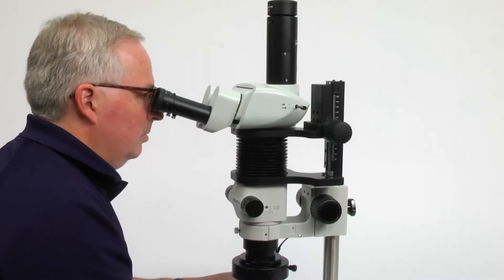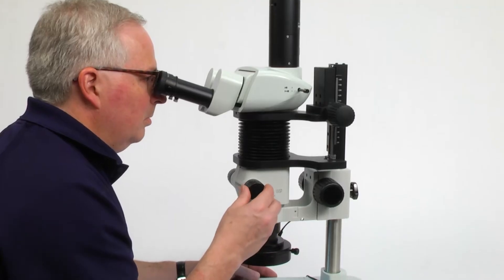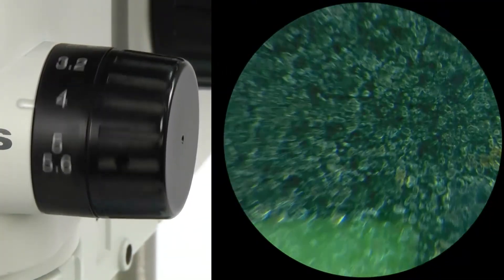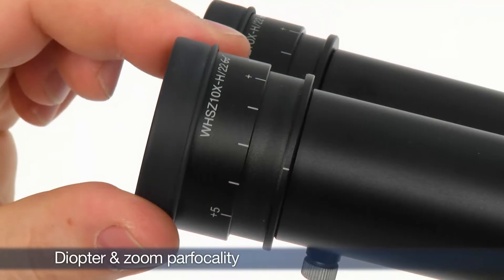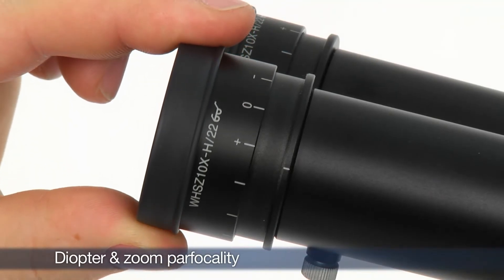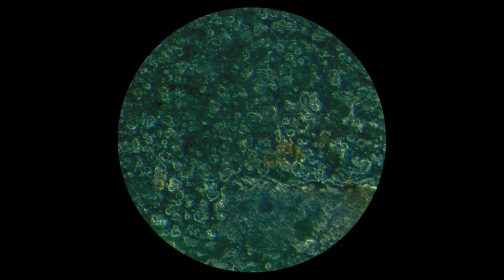Next, the stereo microscope must be properly focused to provide a clear image from low to high magnification. The diopter and zoom parfocality must be properly adjusted to provide consistently clear images through the range of magnifications.